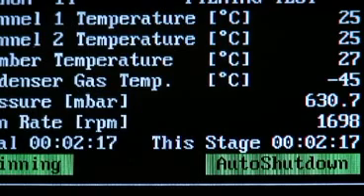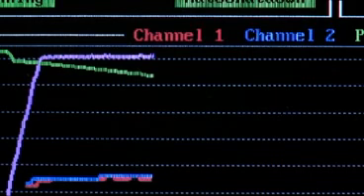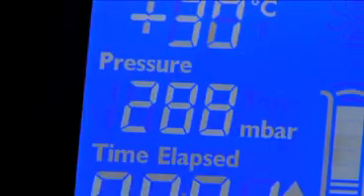The patented Dry-Pure system applies a high G-force at over 500 times gravity to the samples. At the same time, the pressure is slowly reduced so as to carefully control the boiling process. All Genovac evaporators are equipped with technology to directly monitor and control the temperature of the samples inside the system, ensuring samples are not exposed to harmful temperatures.